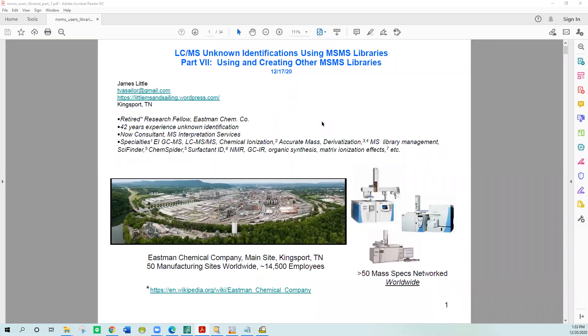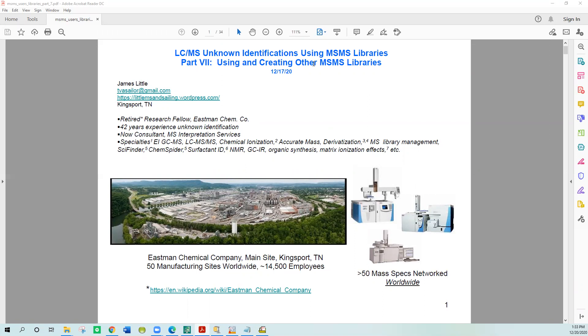Good afternoon. This is part 7 of a multi-section webinar series on LC mass spec unknown identifications using MSMS libraries. This part covers using and creating other MSMS libraries. NIST search considers anything that's not a NIST commercial library as a user type library, so you have to convert it to the hybrid format to be searched within NIST search.